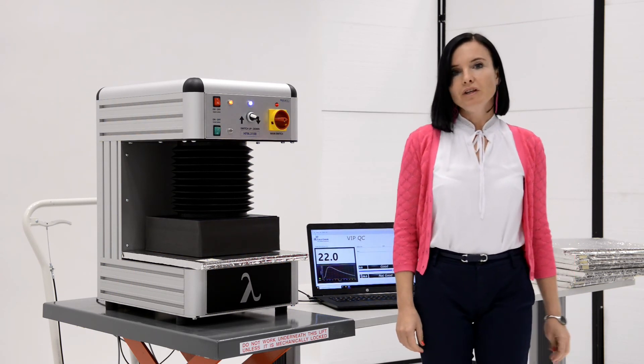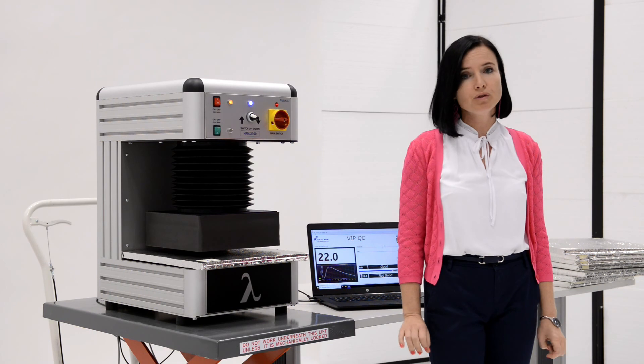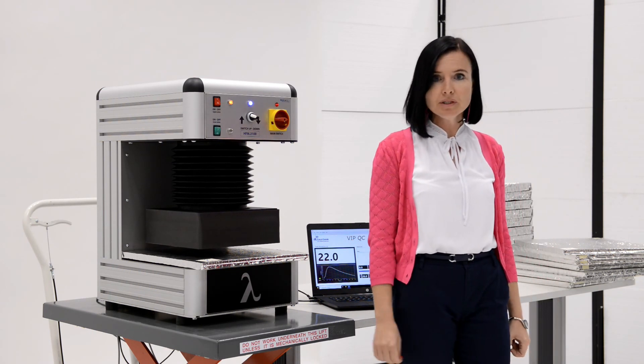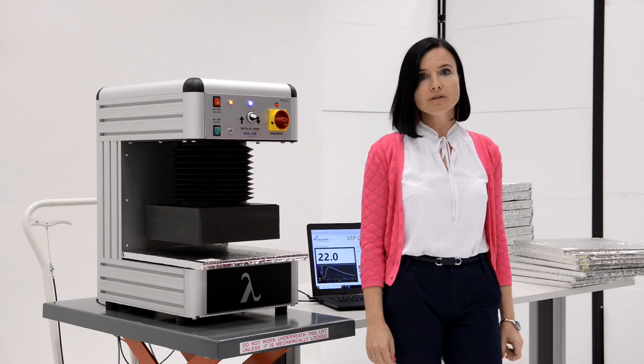We have finished testing a series of samples. The samples before testing must be at room temperature for 24 hours. You cannot retest the same sample immediately — you must put it aside and only repeat the testing after 24 hours.